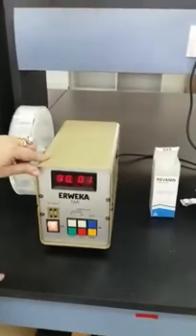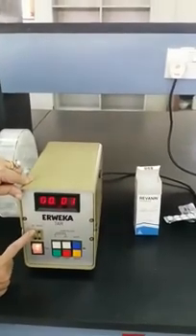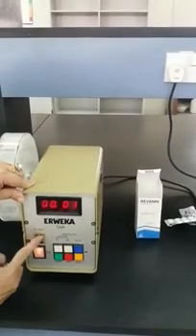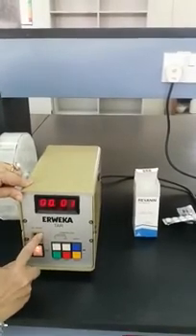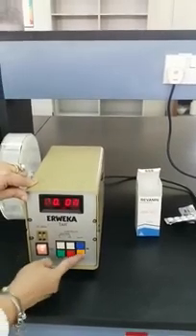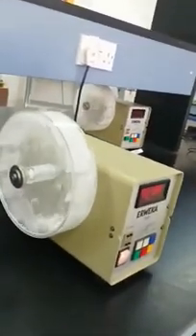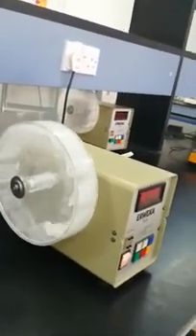And we have to start it, making 25 rotations per minute for the whole 4 minutes. The tablet is attrited. If it is friable, it can lose powder as weight.